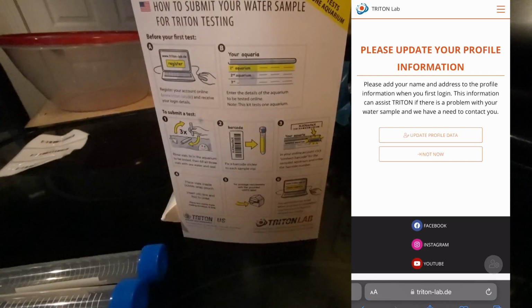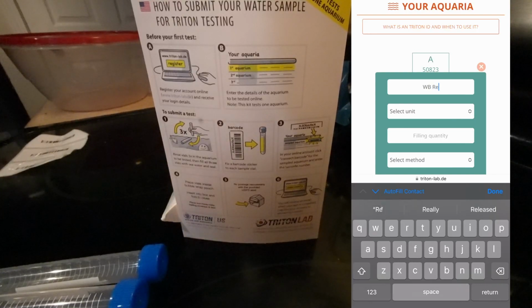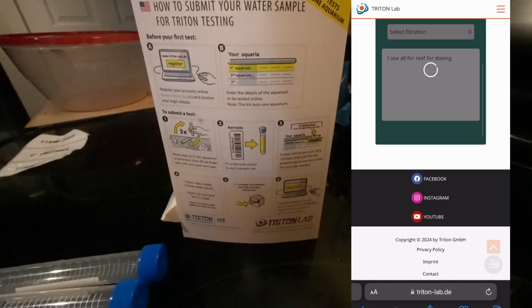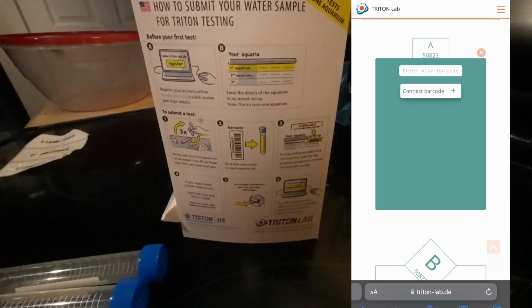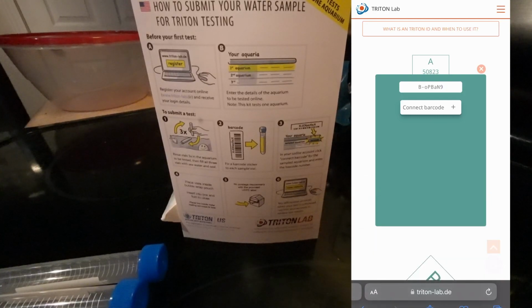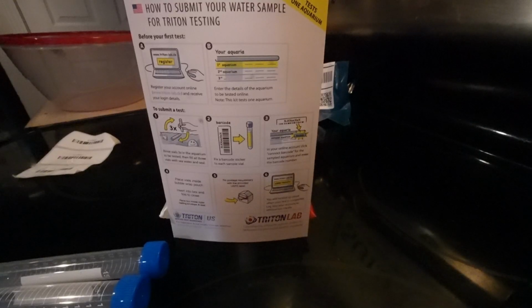All right, I'm going to update profile data. We will need to create our aquarium. I'm going to just call it Waterbox ReefLX. I'll say save. We'll select connect barcode. It says enter your barcode. All right, I entered my barcode. I'm going to click connect barcode. All right, so after we enter the barcode, it looks like we have successfully connected that to the aquarium that was created. And we'll go ahead and collect our results and get it ready to be shipped in.